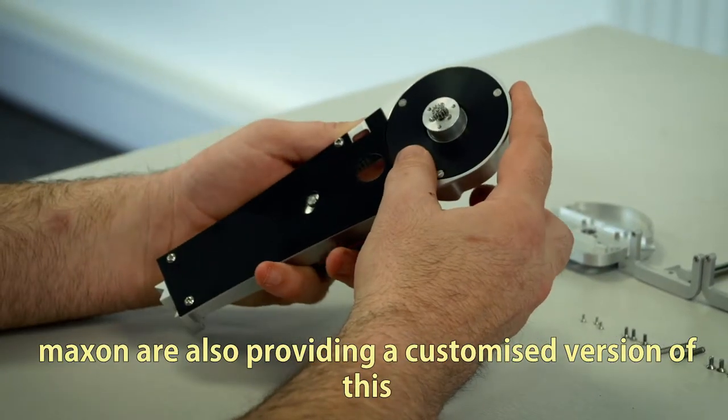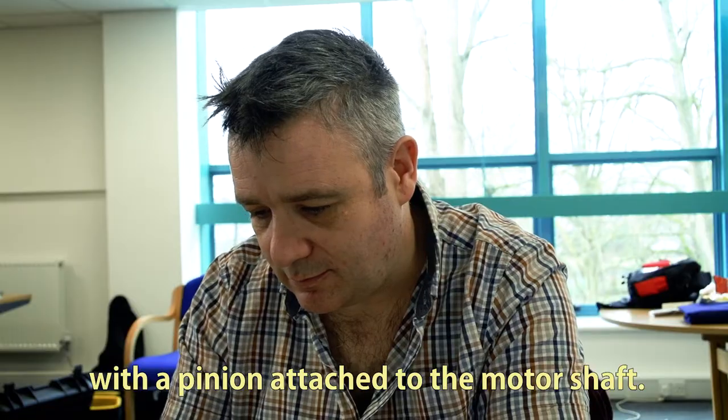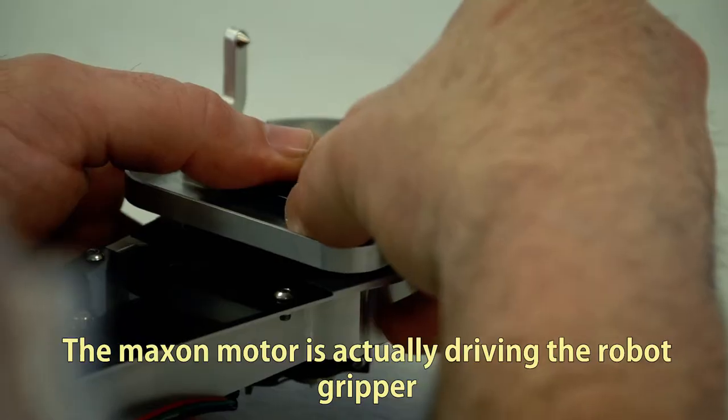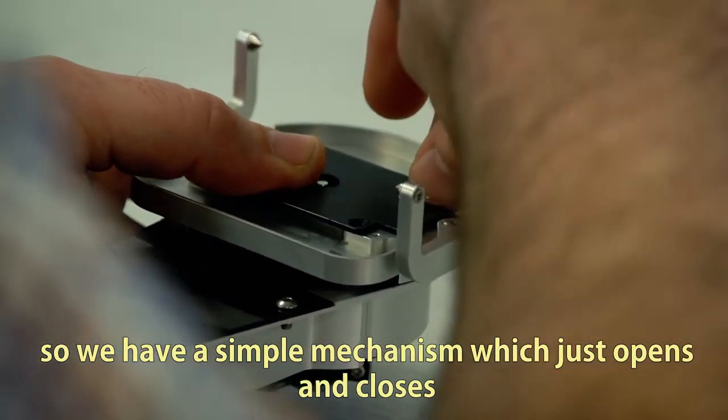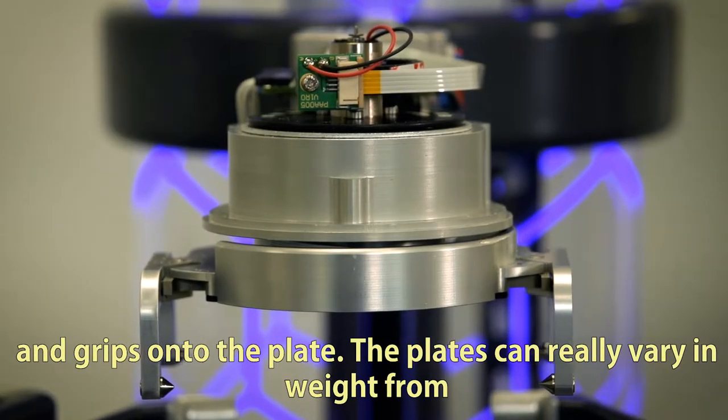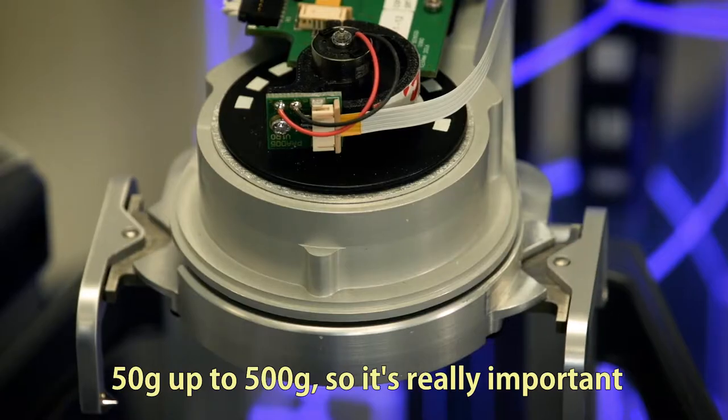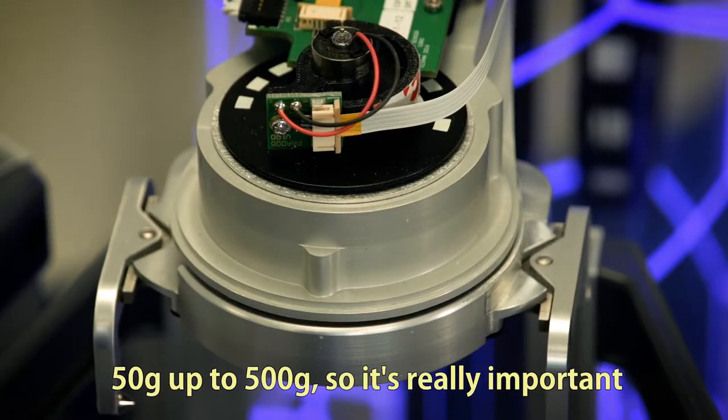Maxon are also providing a customized version of this with the encoder attached to the motor shaft. The Maxon motor is actually driving the robot gripper, so we have a simple mechanism which just opens and closes and grips onto the plate. The plates can really vary in weight from 50 grams up to 500 grams, so it's really important that the motor has a secure grip on the microplate.